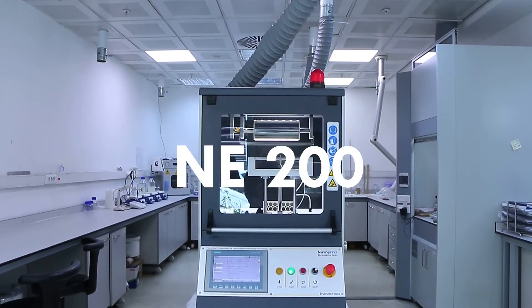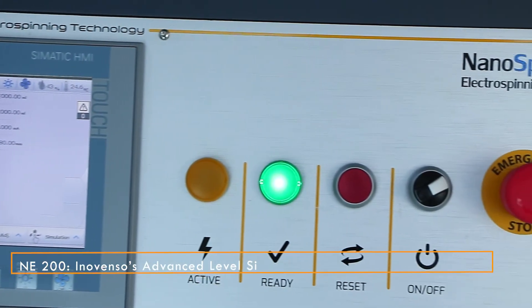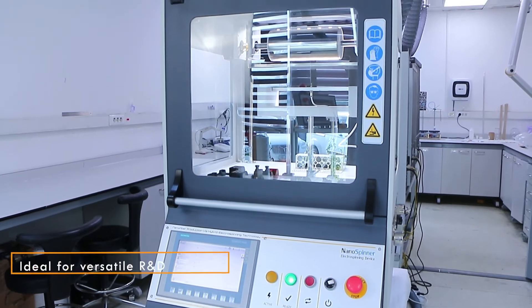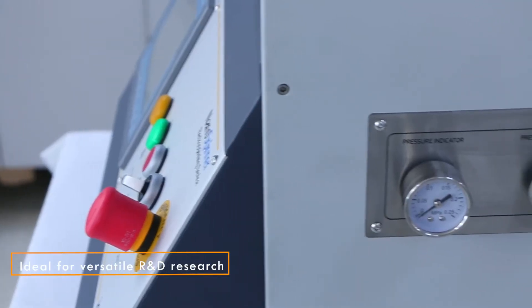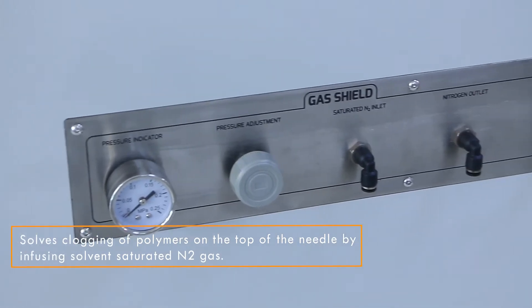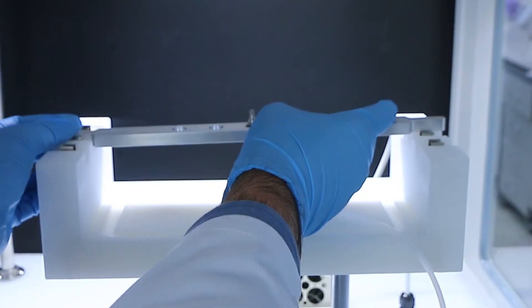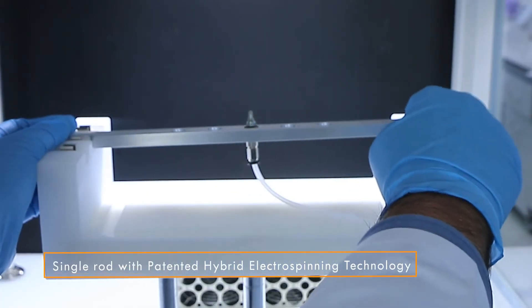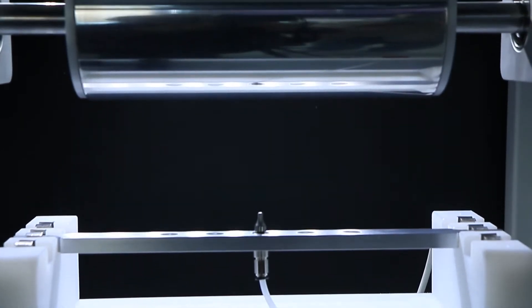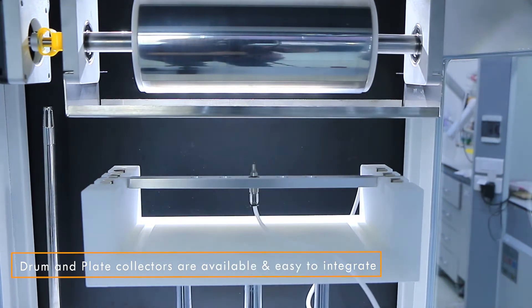The NE200 is Inovenso's advanced level single nozzle electrospinning machine. It's designed for advanced and complex nanofiber material synthesis and for R&D processes that pertain to more complicated structures. It comes with two different collectors: one being the flat plate collector and the other being the drum.